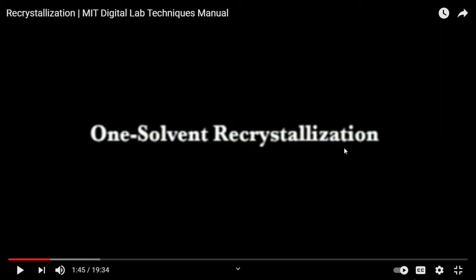Let's go. Now they're showing you how to choose the right solvent. Let's see. Someone's screaming, help, help. Oh, there was my silly action. Somebody's mocking me, huh? Okay, let's go. There are a couple of different methods. In our school, we only do one solvent system, but it's good to know how other places like MIT and Columbia do it.